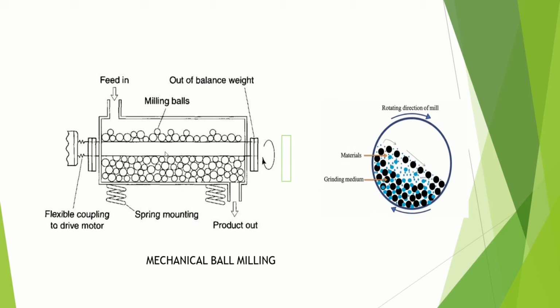This shows the inside of a ball mill. Material and grinding balls are loaded in. As the chamber rotates, the balls collide with the material and grind it down. The product then comes out of the other side. See this cross section? That's how the grinding media crushes everything.